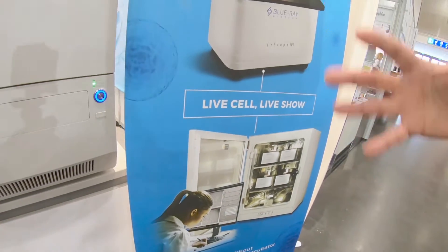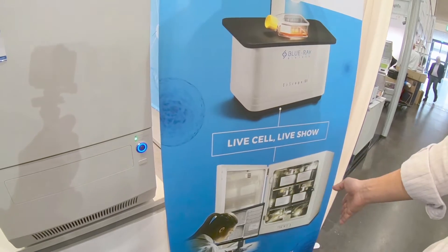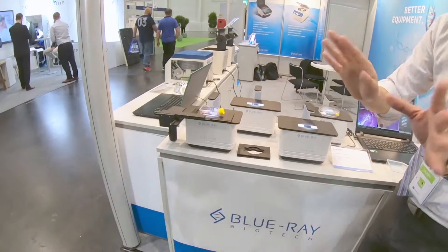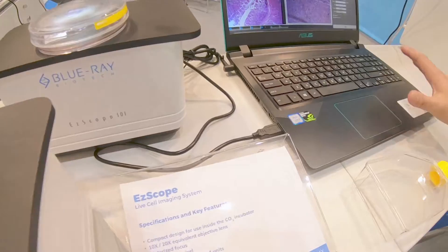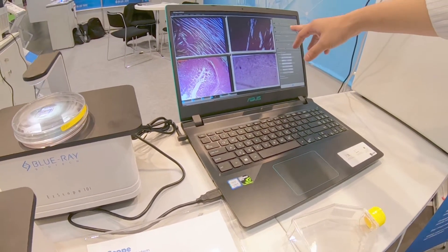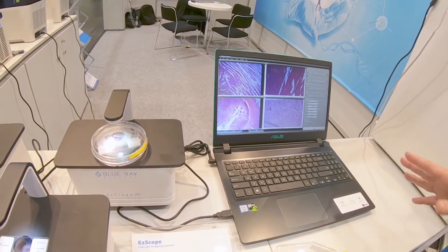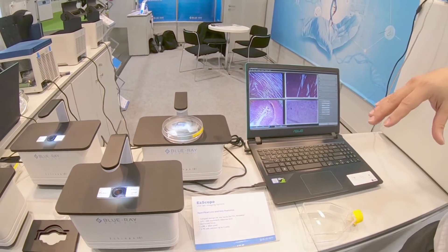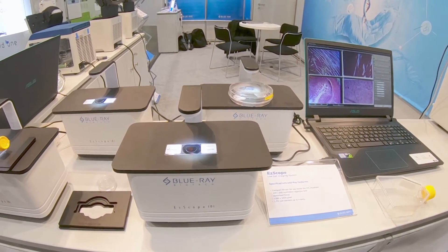As you know, cell culture tests usually have a control group, test group one, test two, and test three. For us, four units use a series connection — not parallel — meaning only one cable is connected and everything is controlled by an outside computer. The customer can adjust the LED intensity, focus, or exposure. We also have auto exposure, and you can capture images or do time-lapse video.